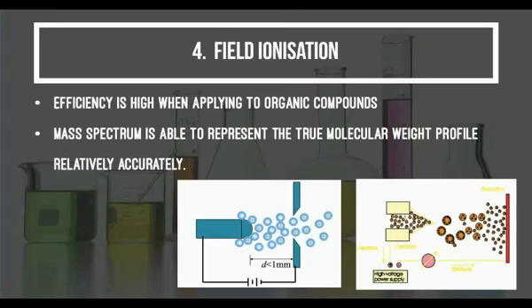The spectra consist of number 1, intact molecular ions from individual chemical species originally present in the sample. Number 2, ions produced from any ion fragmentation that may occur. And number 3, molecular ions of fragments that are generated thermally during the ramped heating. The ion fragments are most often totally negligible as asserted above, but the thermal fragments can be substantial depending on the volatility and reactivity of the sample.